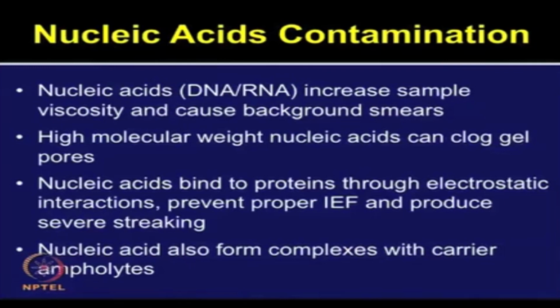These nucleic acids can bind to the proteins through electrostatic interactions, and it will interfere in the isoelectric focusing step, and it may ultimately result in severe streaking. The nucleic acid can also form complexes with the carrier ampholytes, which are added during the isoelectric focusing step.